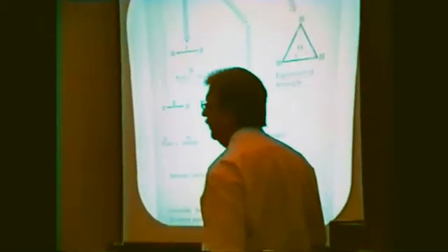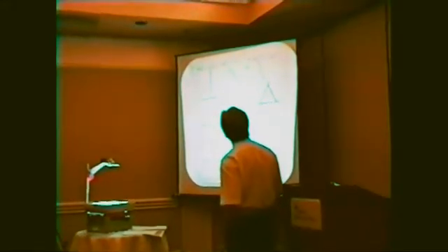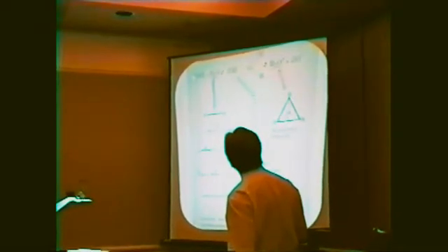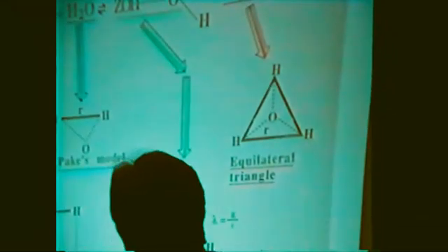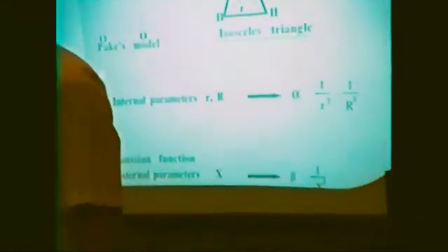That means very often, if we have 1, 2, 3, 4 species, and of course, we have to define the distance between these two protons, between these three here. We generally have about 9, 10 parameters to be defined in order to have a good simulation of the spectrum.